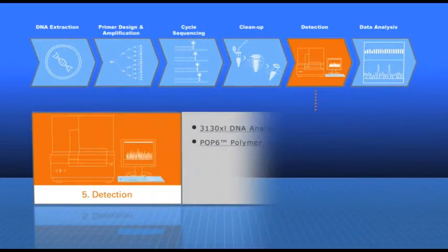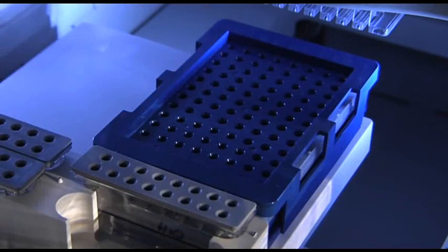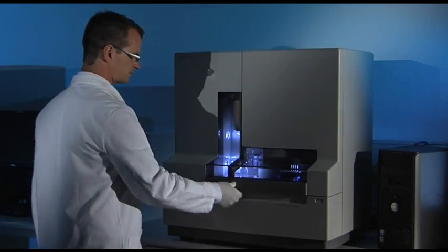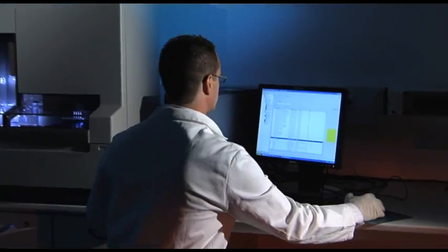Detection: The sequencing fragments are now ready to be placed directly into the multi-capillary electrophoresis system utilizing a specially designed fast plate adapter.